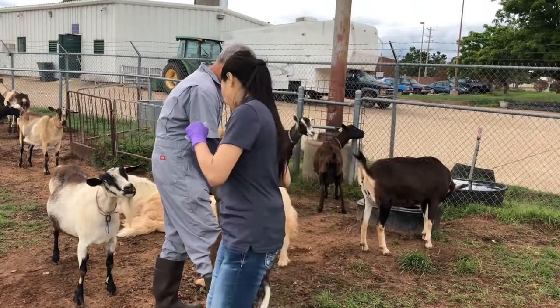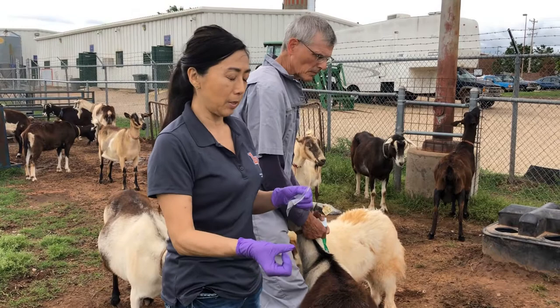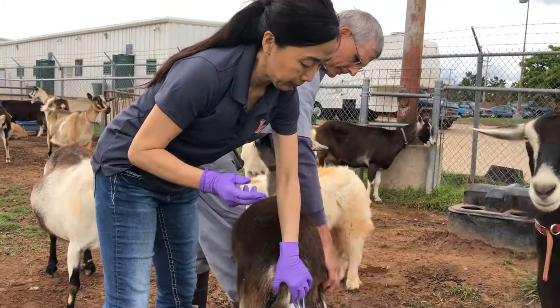You ask your helper to hold the animal, then you put the lube on your finger. You want to open the back from here, then pick the tail up.